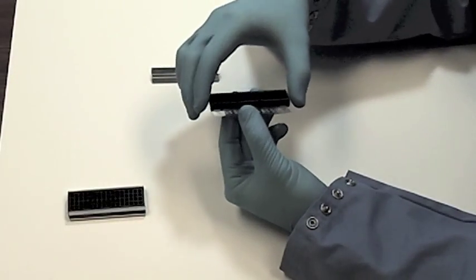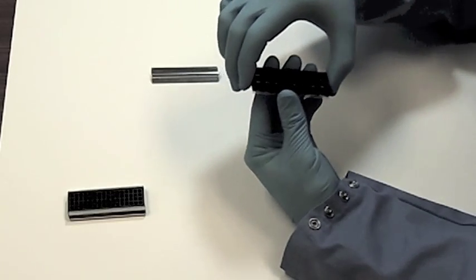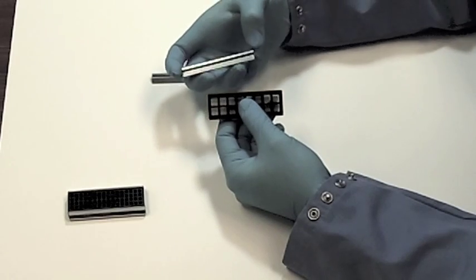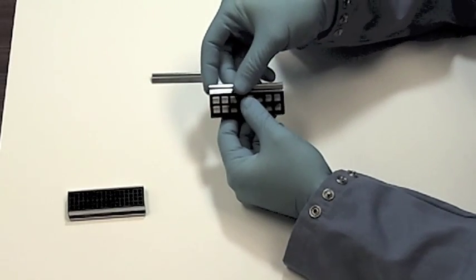When assembled, the ProPlate system forms discrete subchambers on top of the microscope slide. Many formats are available. Shown here is a 16-chambered system.